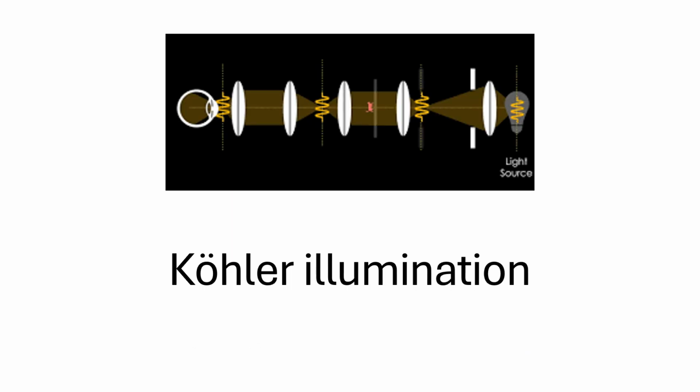Thank you, Jen, for that review of proper posture and the components of a microscope. I'm Lisa Marinelli, and I will be discussing Kohler illumination, taking measurements, use of a polarizer, and some common troubleshooting issues. And we'll start with discussing Kohler illumination.